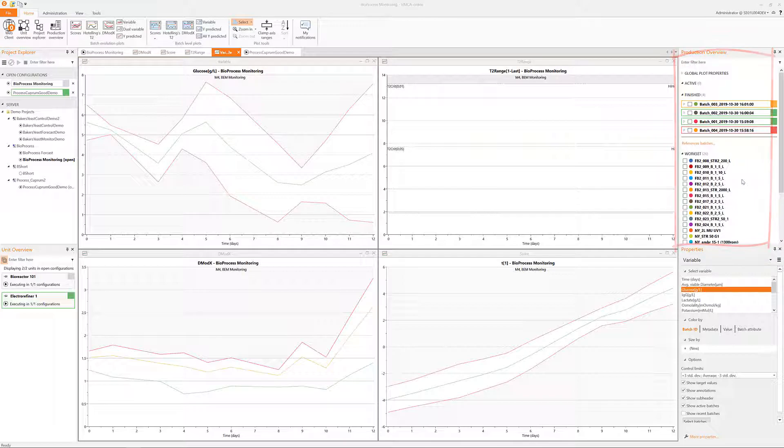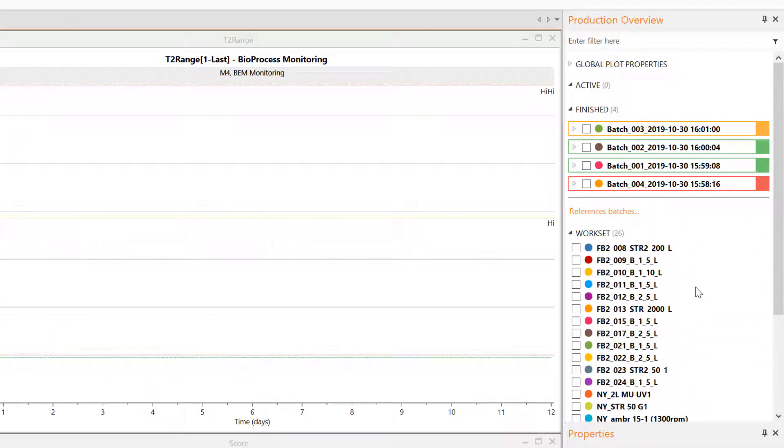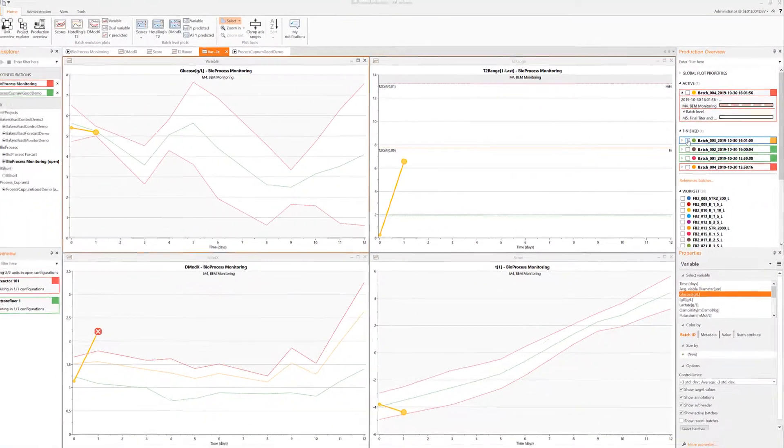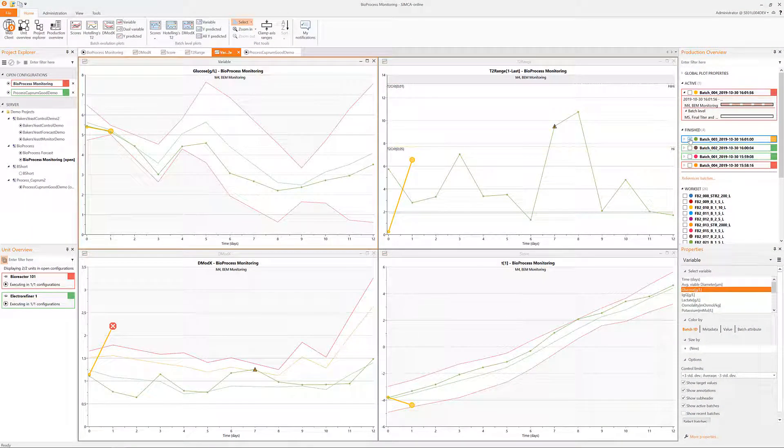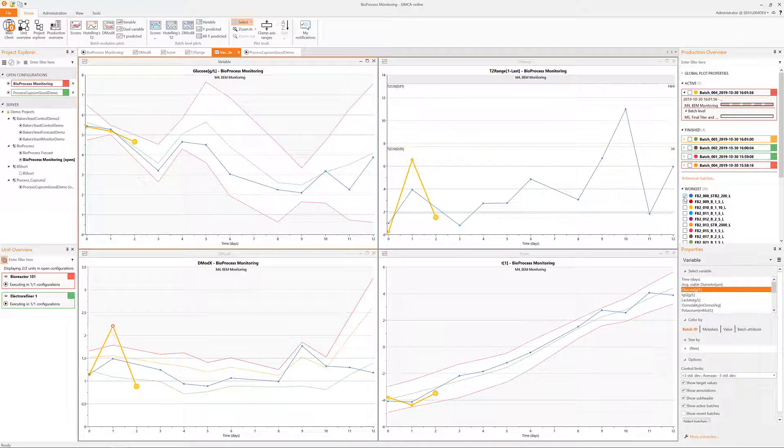The top pane of the two right side panes works as a legend to the production where actively running batches as well as finished and workset batches can be found. Ticking and unticking the checkboxes will change what is seen in all of the charts simultaneously.